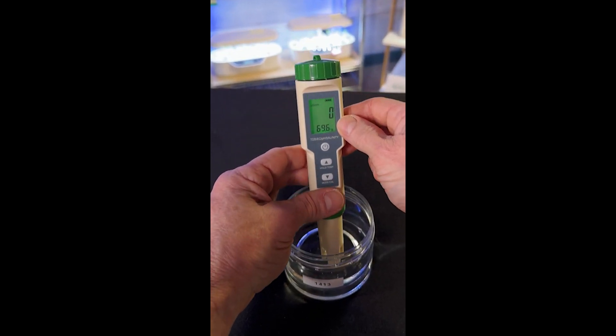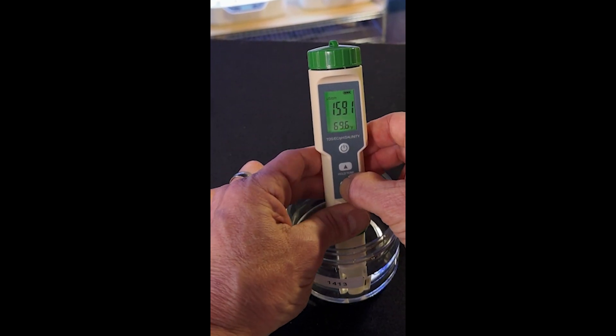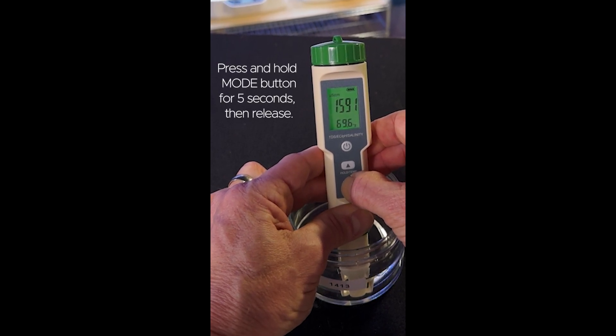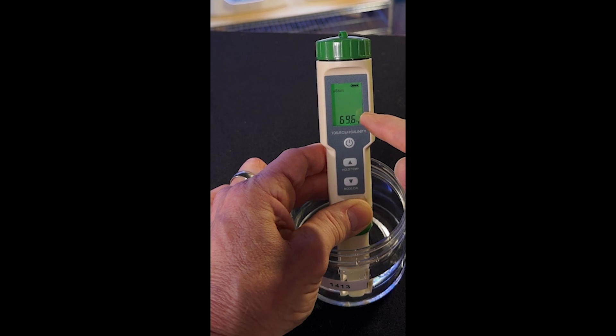Now dip the meter into the solution and press and hold the mode button for about 5 seconds, then release. You'll notice that the display begins to blink.